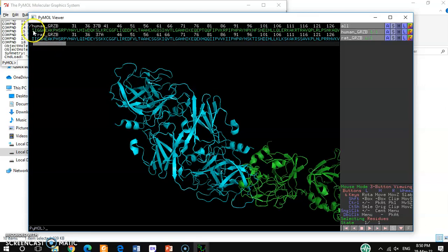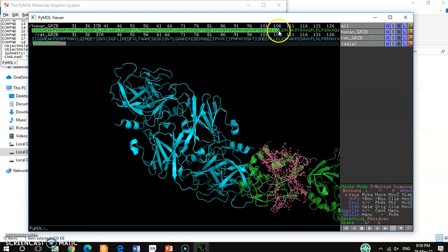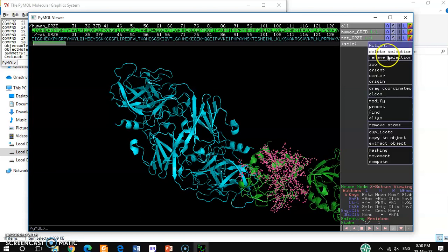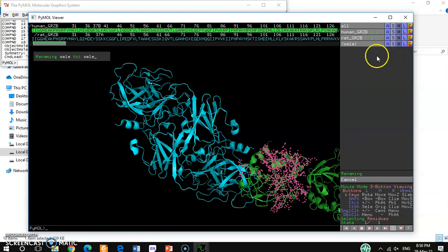I want to select maybe a small fragment up to residue 127. Then I want to rename the selection — hit 'rename selection' and you can write down the name: 'human granzyme B'.